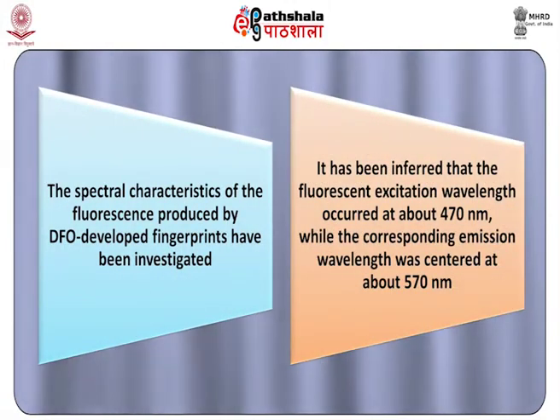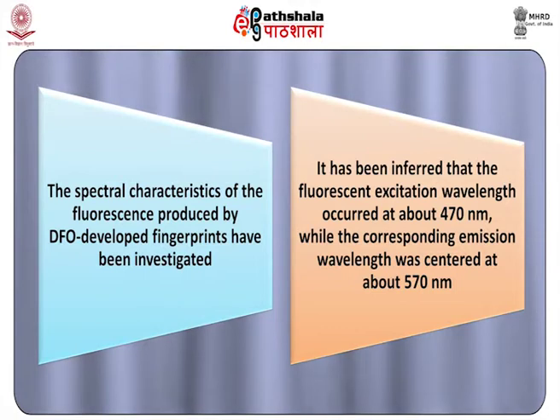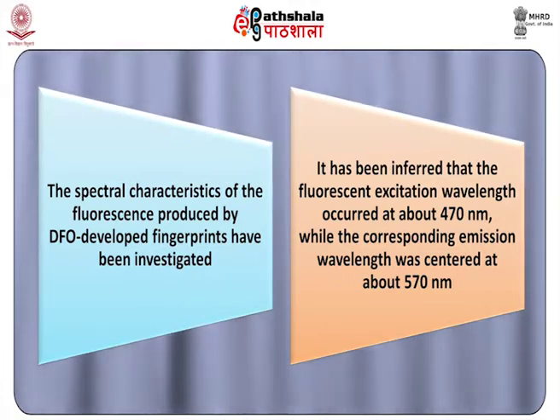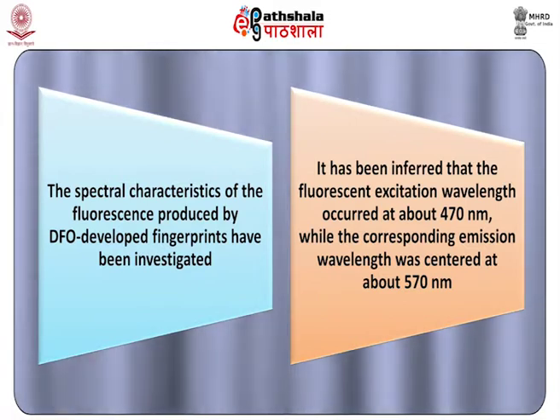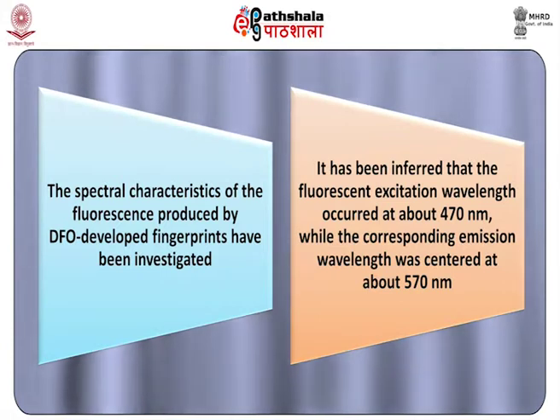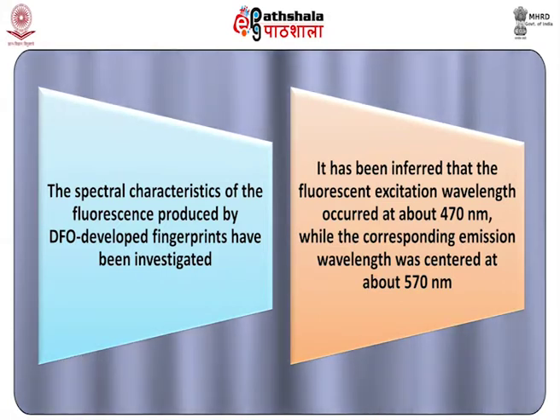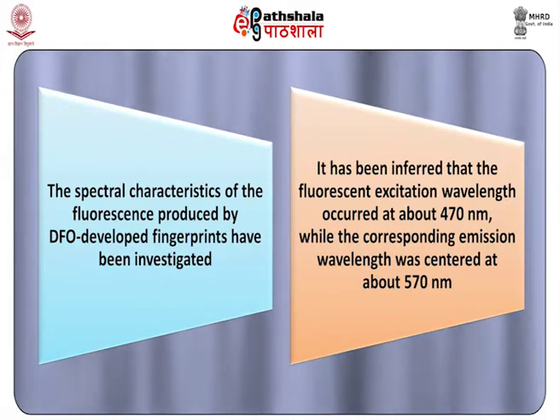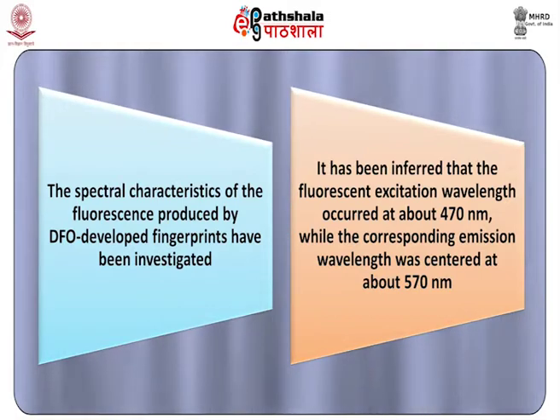The spectral characteristics of the fluorescence produced by DFO developed fingerprints have been investigated. It has been inferred that the fluorescent excitation wavelength occurred at about 470 nanometers, while the corresponding emission wavelength was centered at about 570 nanometers.